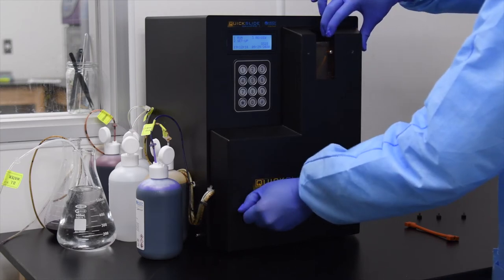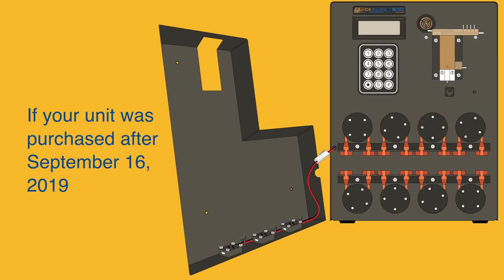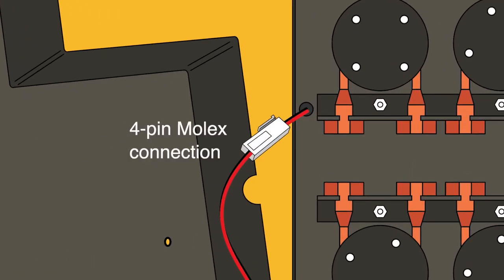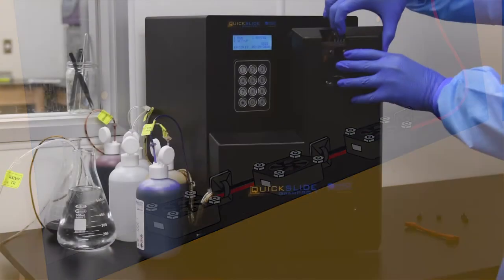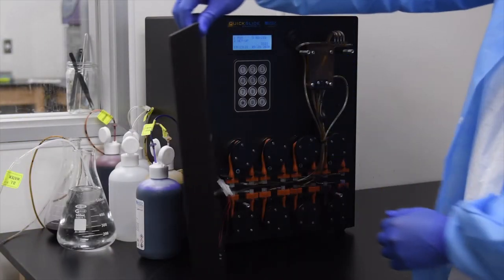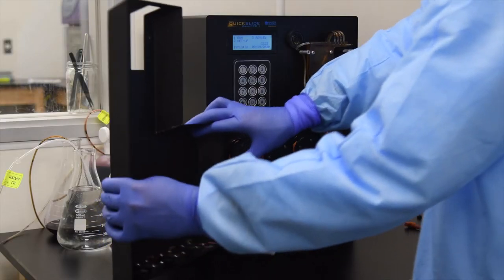If your unit was purchased after September 16, 2019, it will have a four-pin Molex connection attaching three case fans on the cover. Pivot the pump cover along the left side of the machine, carefully disconnect the Molex connection, and lay down the pump cover.